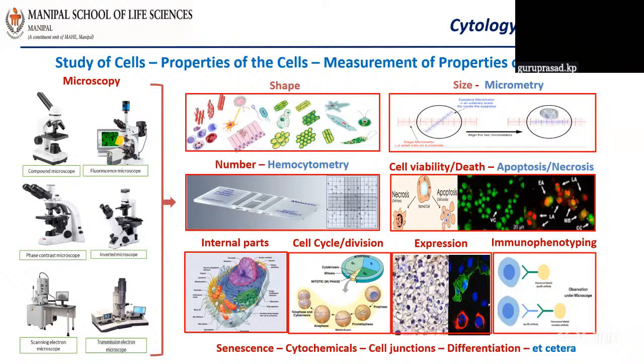In addition, we have already studied meiosis and mitosis. In other words, we identify the stages of a cell, whether it is in interphase or in a division phase, whether in prophase, metaphase, anaphase, or telophase. All these things we observe using the microscope as a tool.